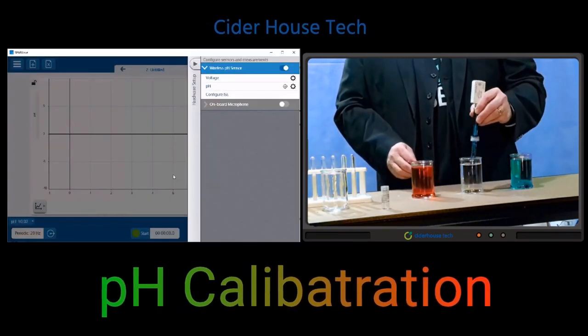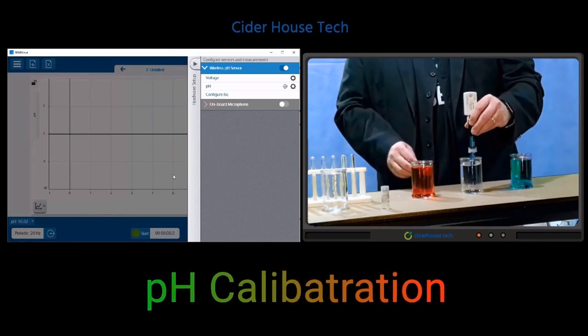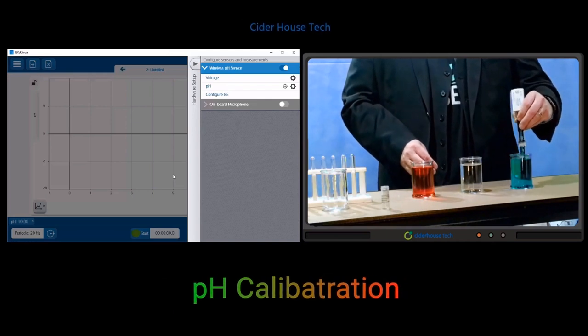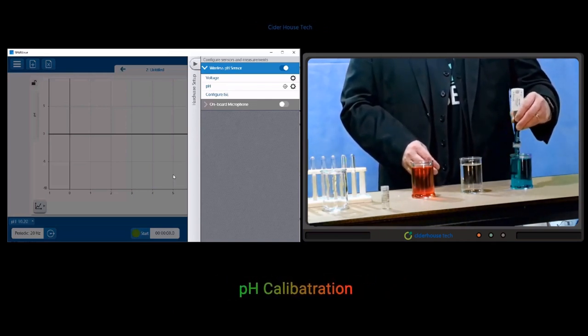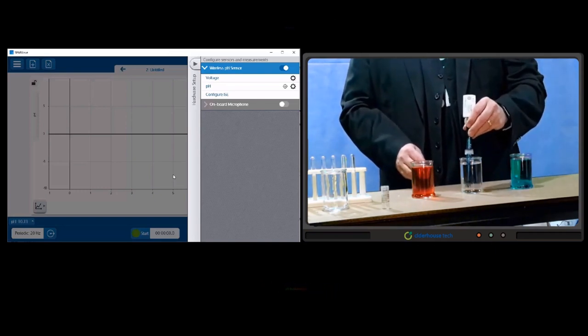My pH electrode is now ready to be used. But before I place that into any solution I'm going to measure, I'm again going to rinse my electrode with deionized water. And then I will blot it dry before usage so that I am not diluting the solutions that I will be measuring.